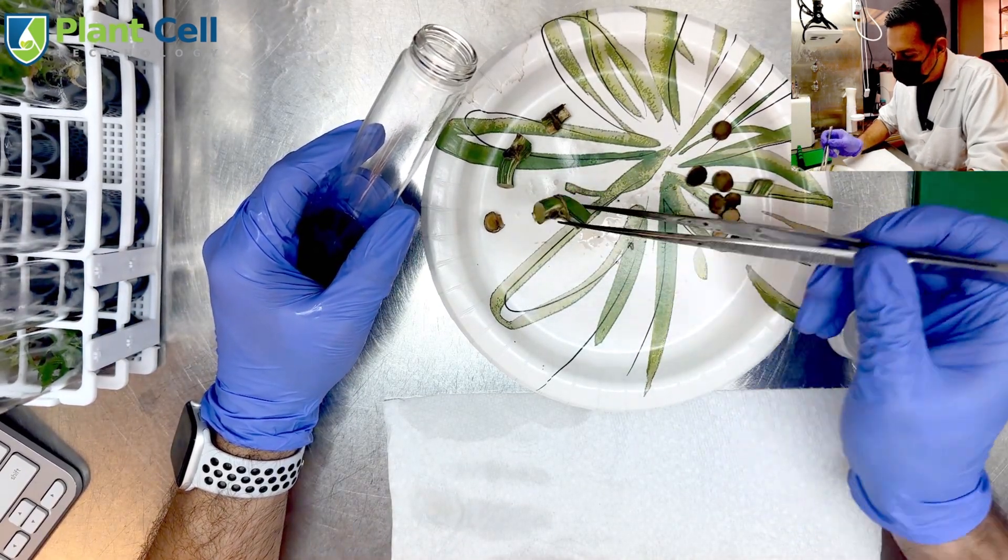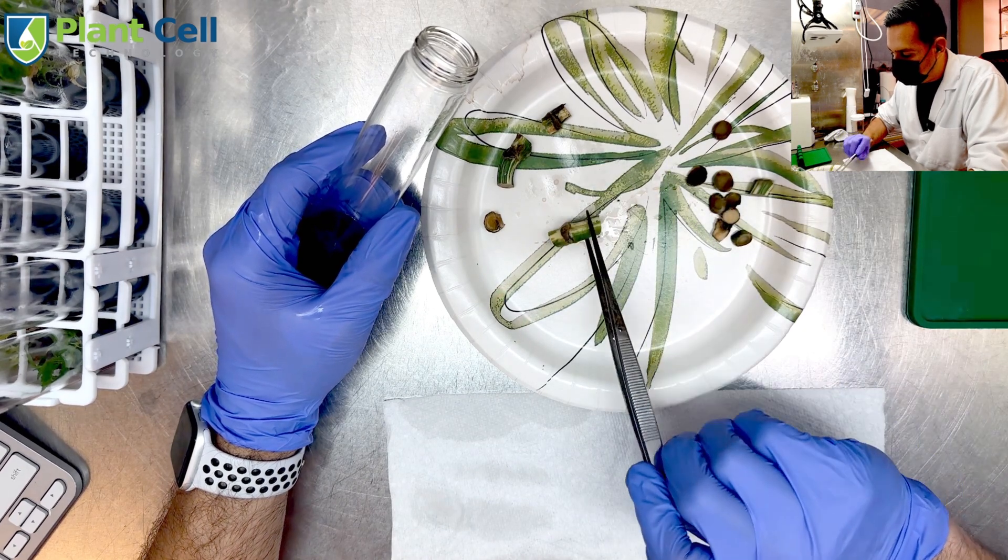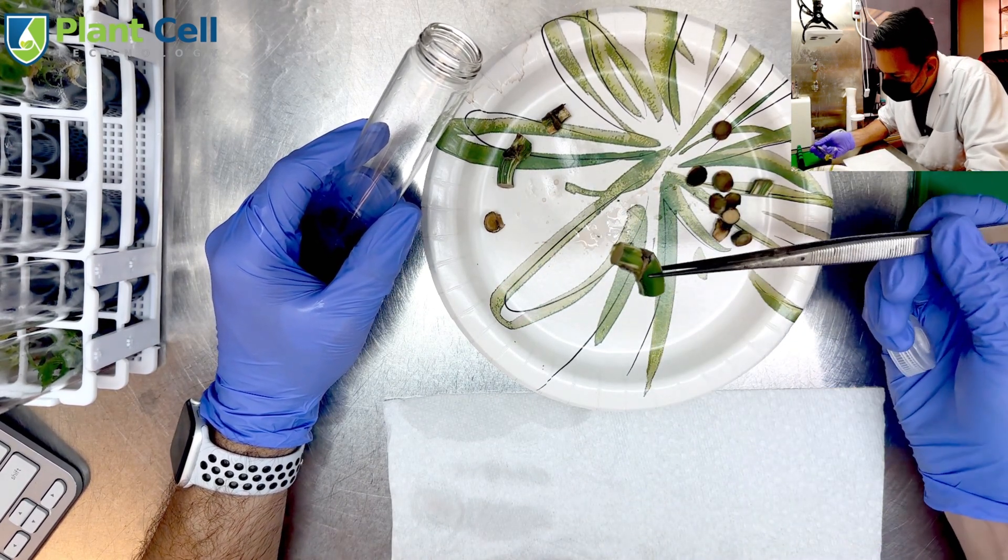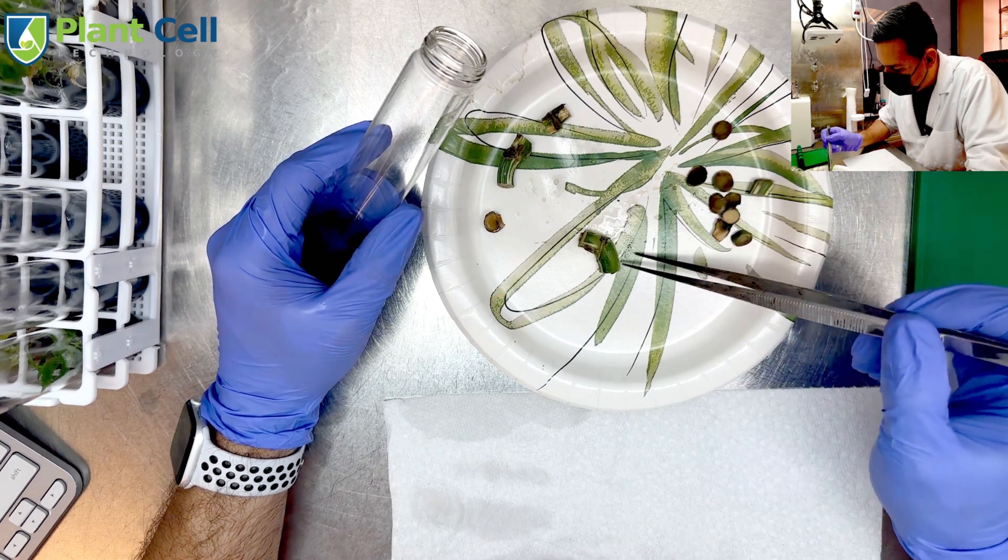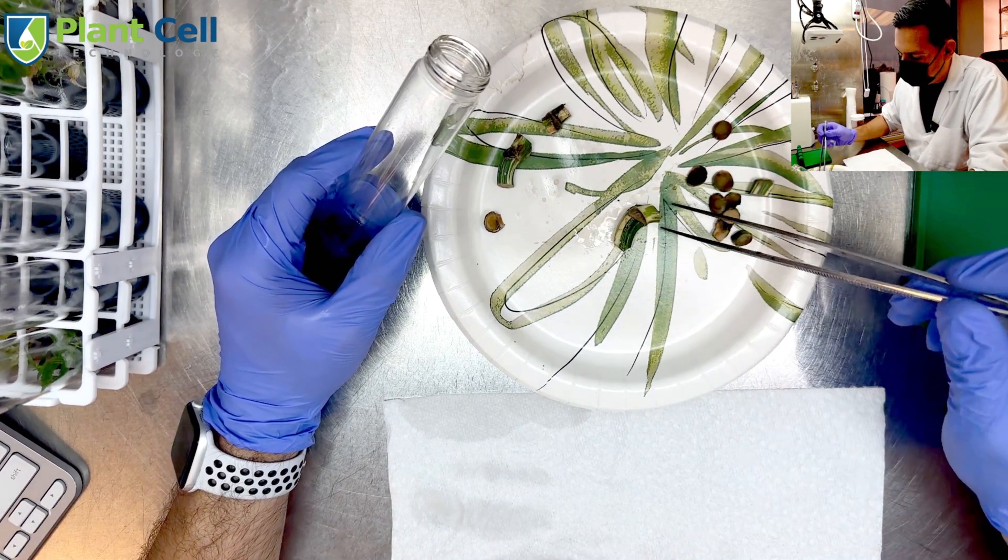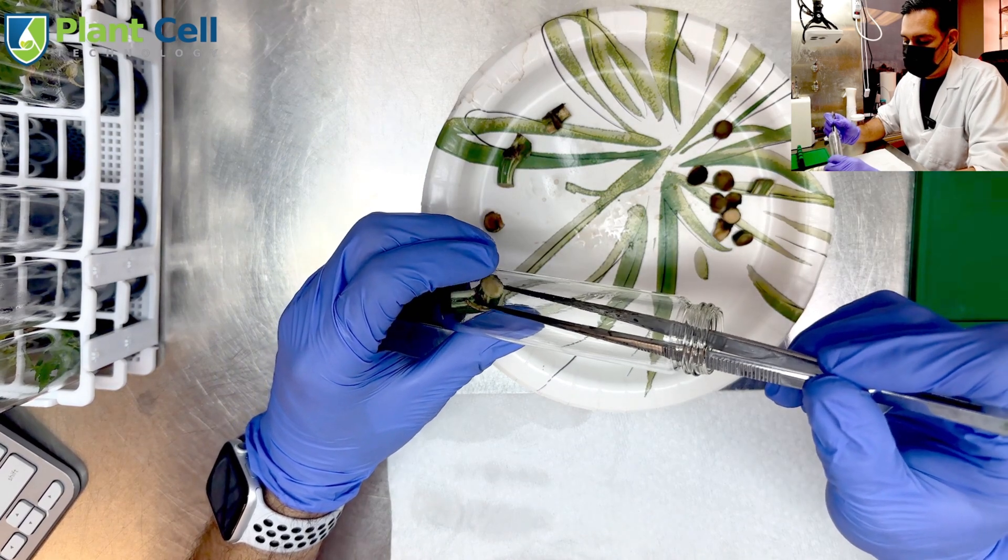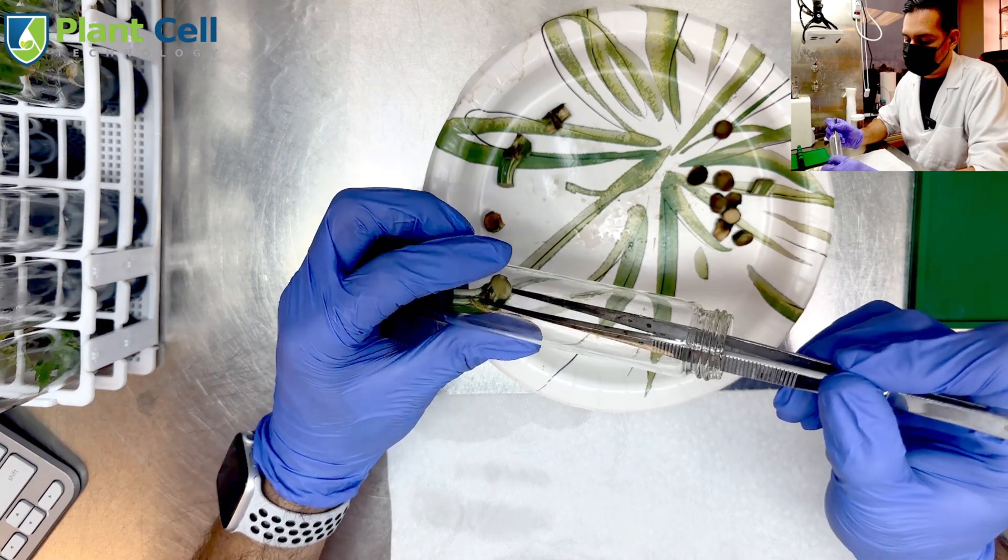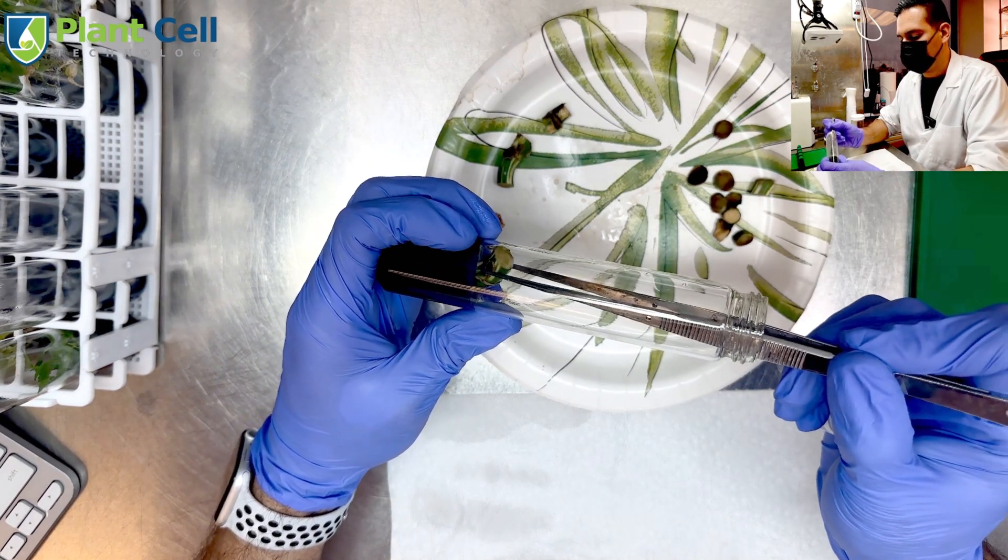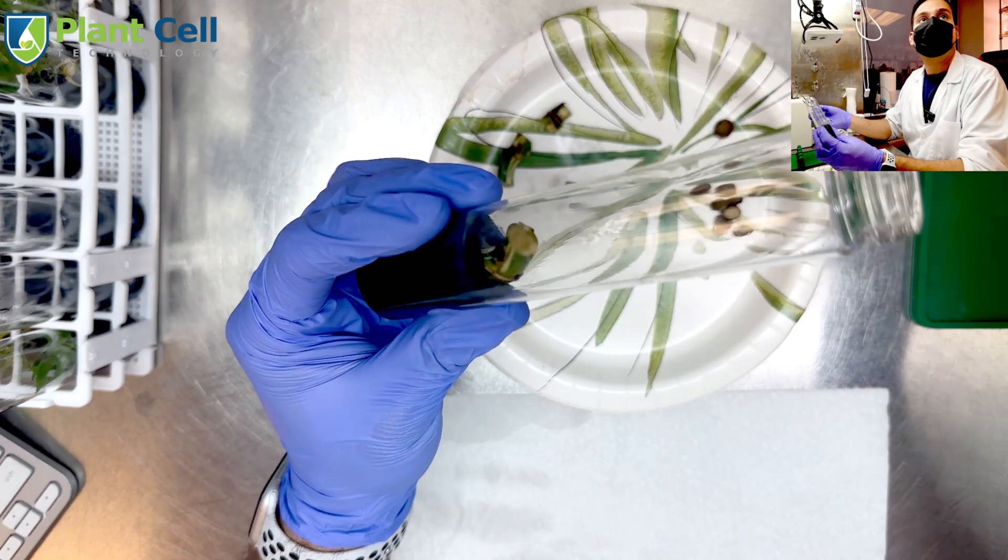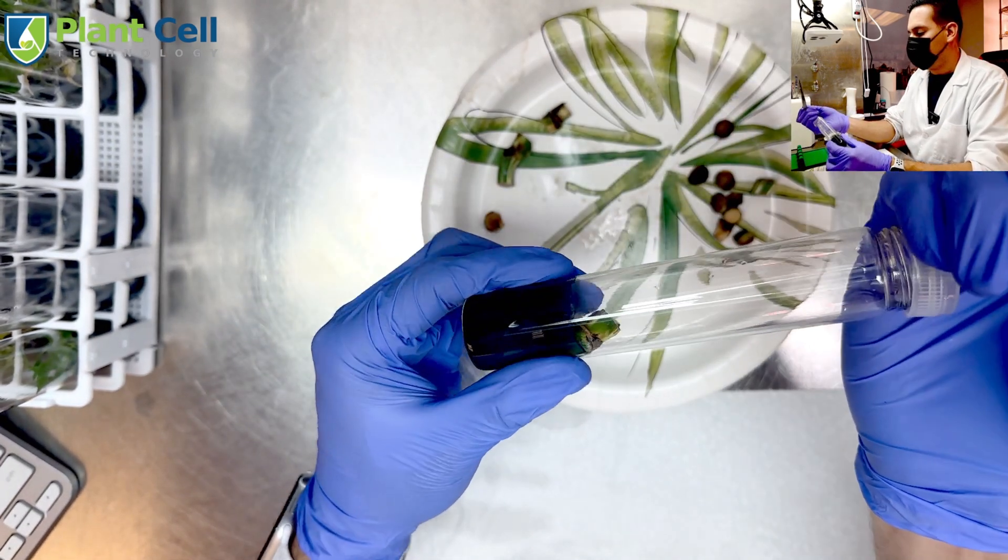It's hard to tell which side is up and which side is down. I should have made a reference. I'm just going to set it like this. There we go, and then just let it sit in the test tube.